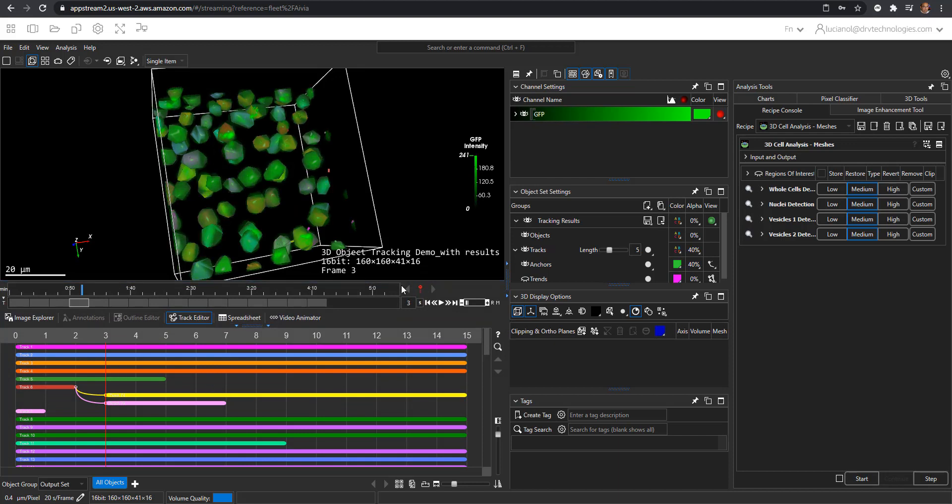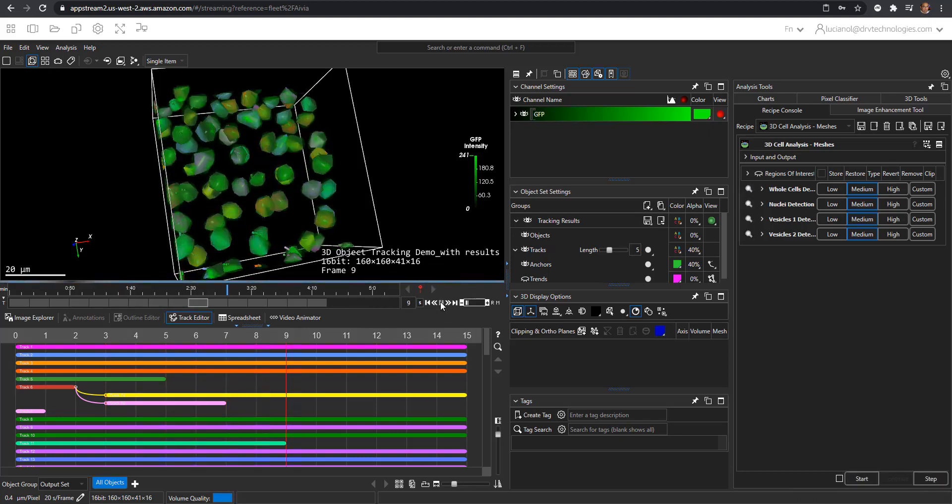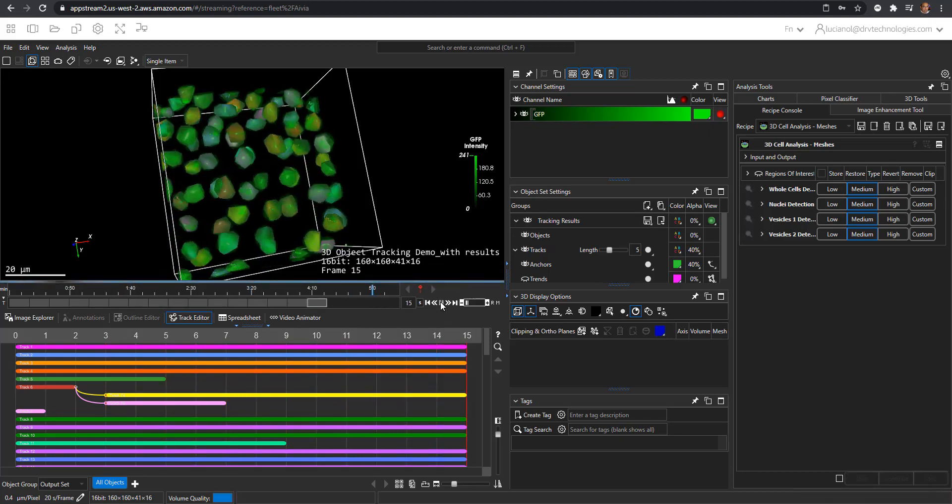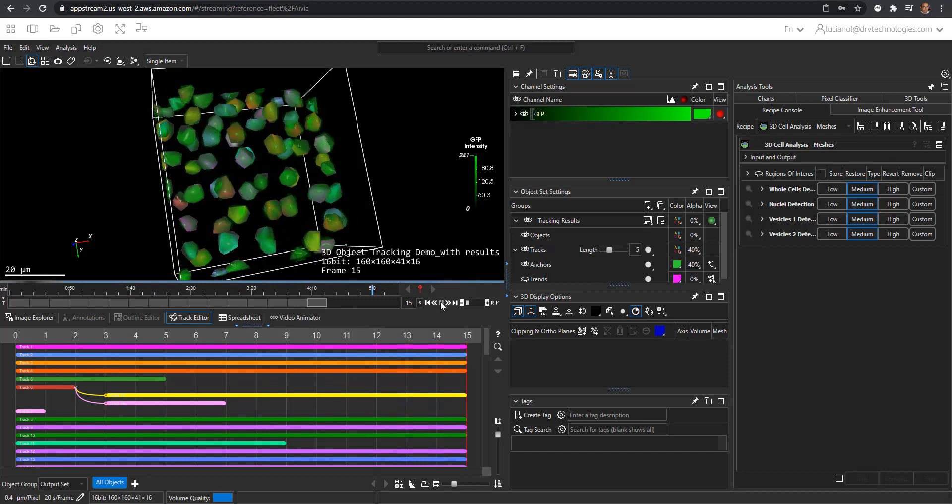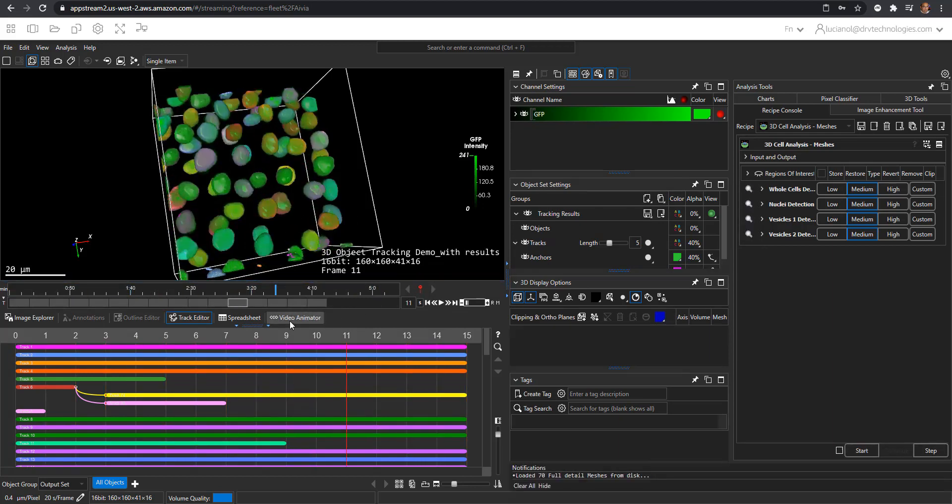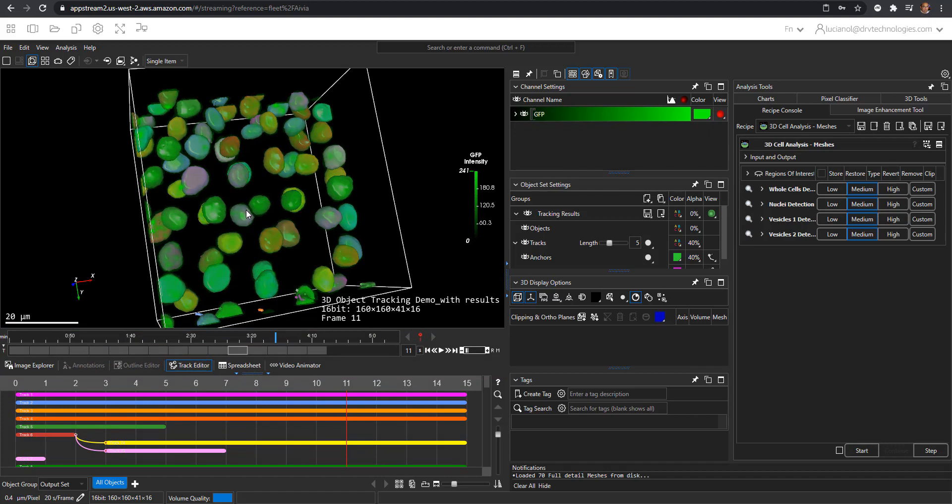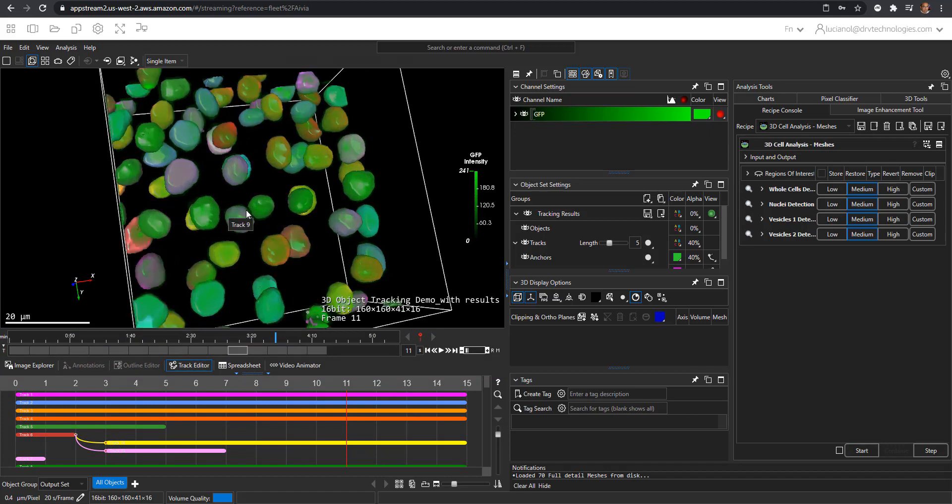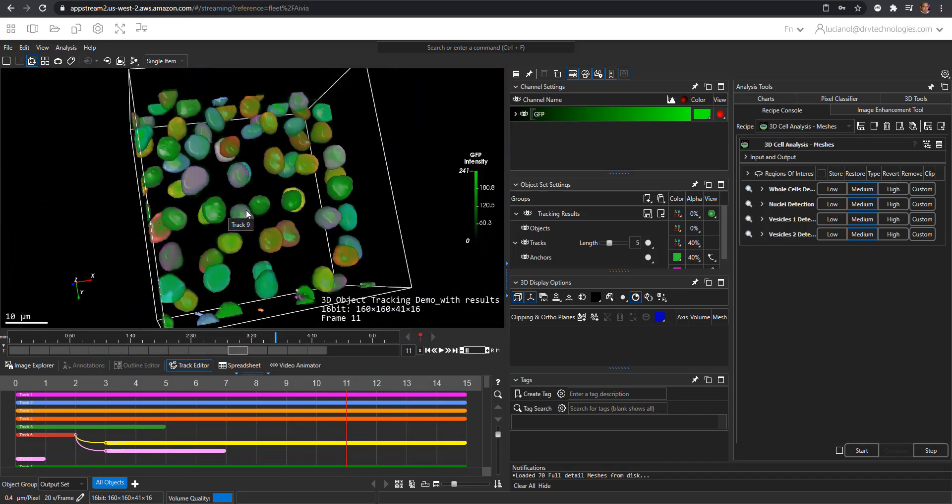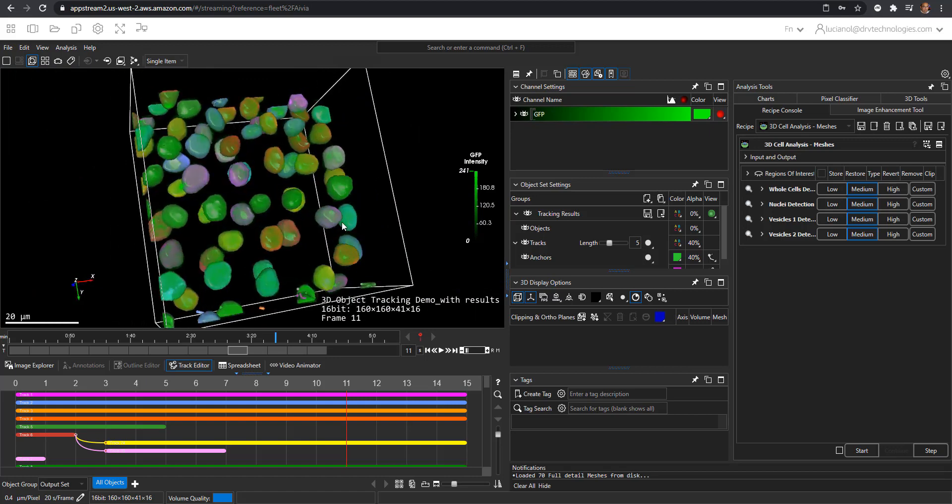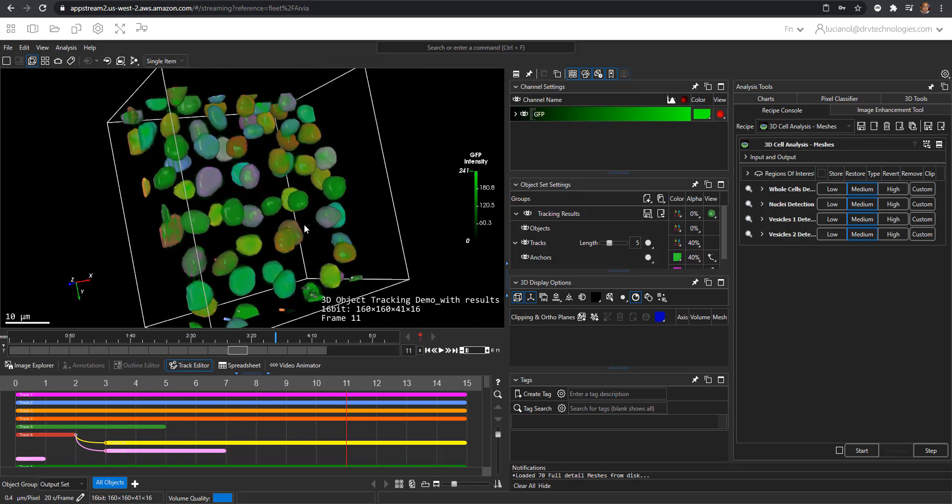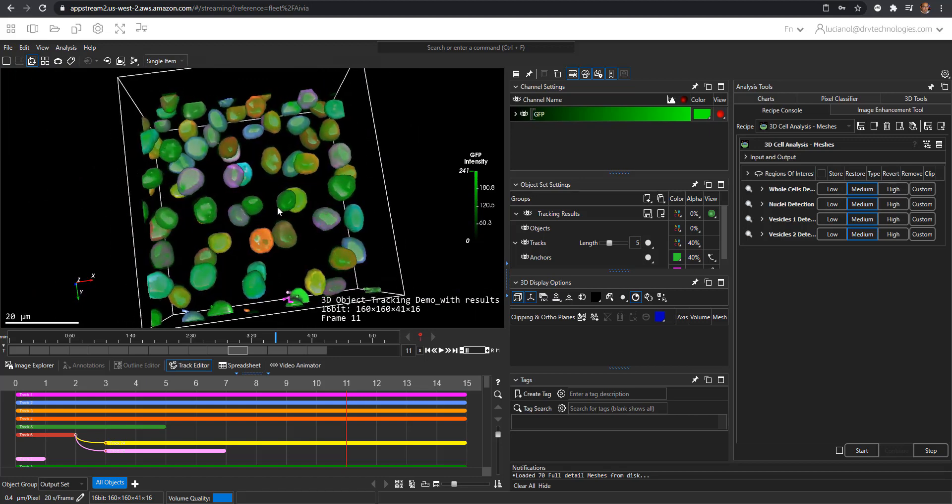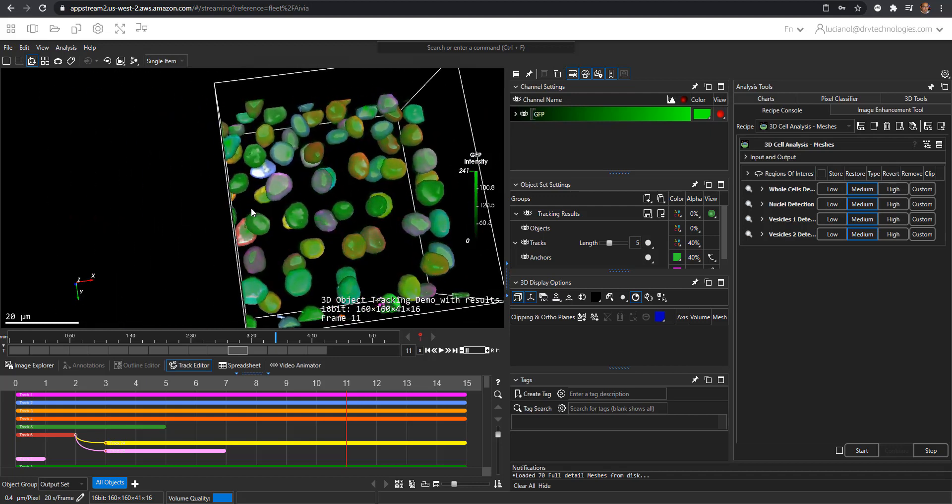You can play through the video with the play button. To zoom into the dataset, use the wheel to go forward or backward. To rotate, use left click on the mouse; to translate, use right click on the mouse.